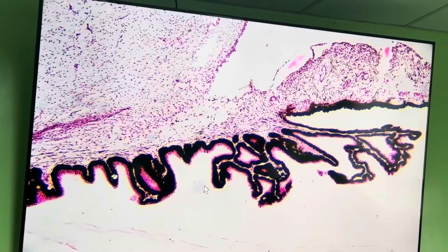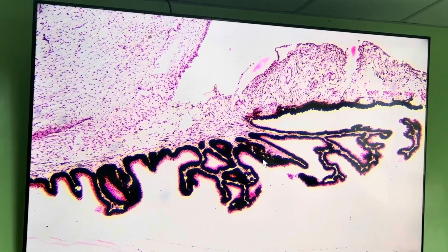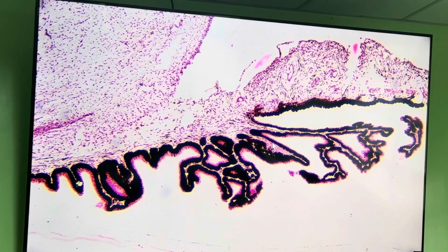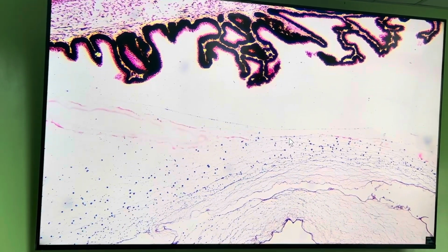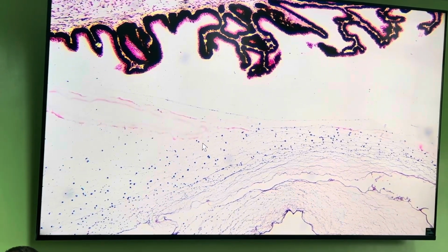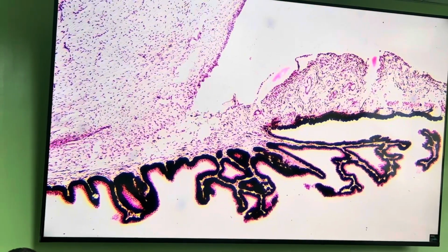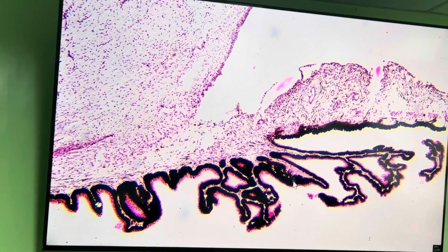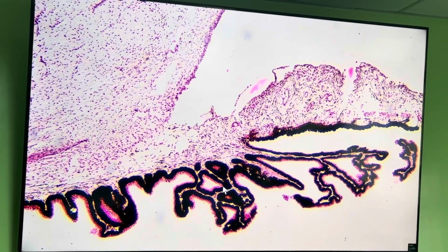We have the ciliary body, which will be composed of several ciliary processes. Its function is mainly to produce the aqueous humor, as well as to serve as point of attachment of the zonular fibers, although in this case, there has been disruption of its attachment. So you can see that the iris as well as the ciliary processes are pigmented, so they contain melanin.